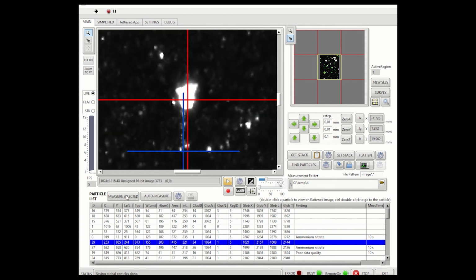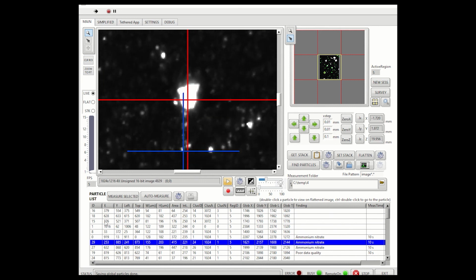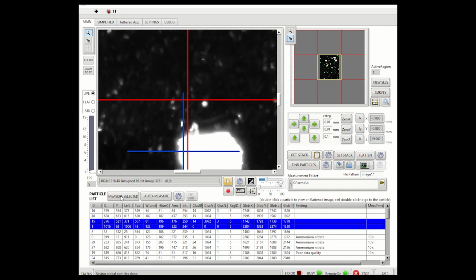Now here we use the instrument manually, but there is also a more automated mode where the user would press a single button and the whole process that we described today would run automatically through all the steps, from the image analysis, particle location, and then driving the system for the chemical analysis of the various particles, slowly populating the list with the names of the chemicals identified.